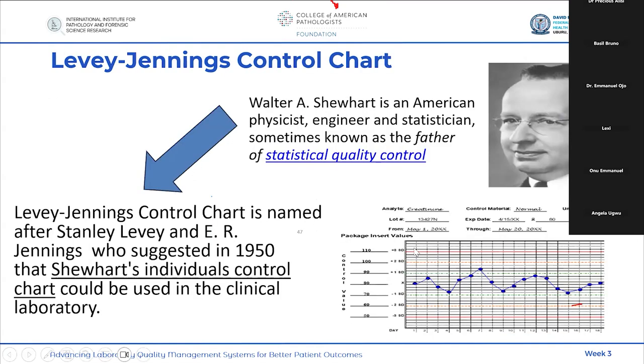So once I'm able to put that here, let's say from February 1st, I've exhausted the old one, and I've established my QC limits using that data collected in January. From February 1, I can come here and start plotting. And immediately I'm plotting, then I can know where my data actually falls for that particular run. So that has answered that part.